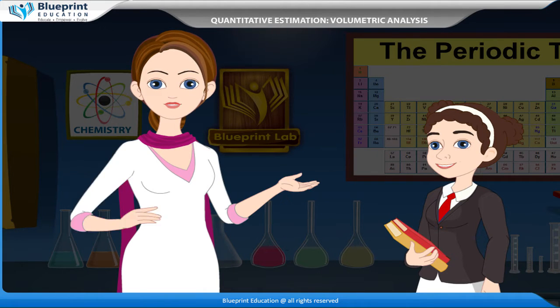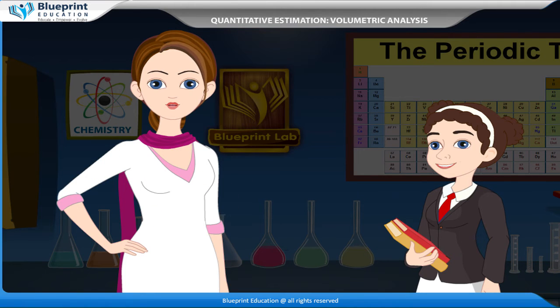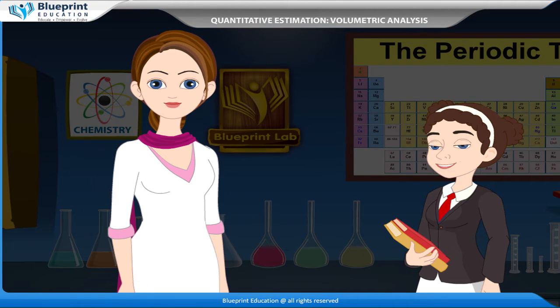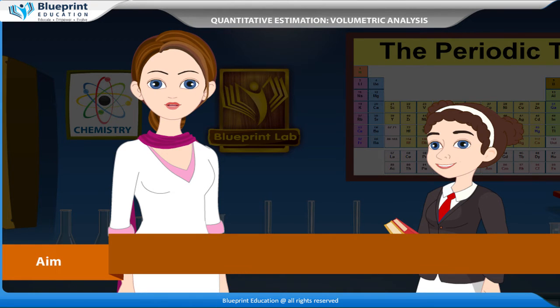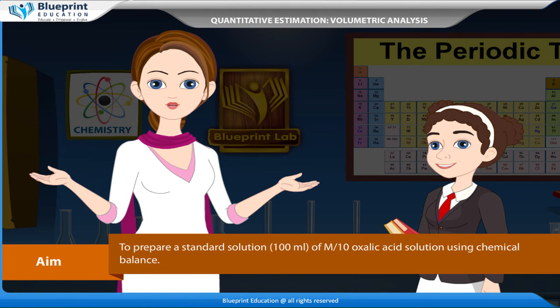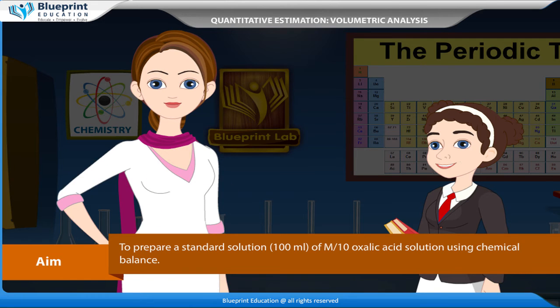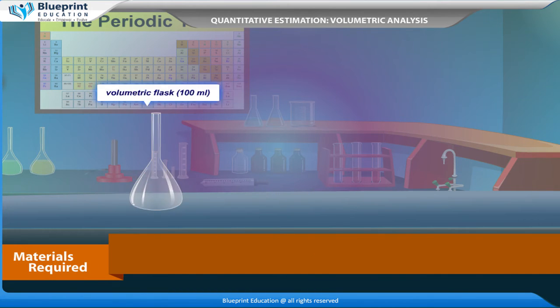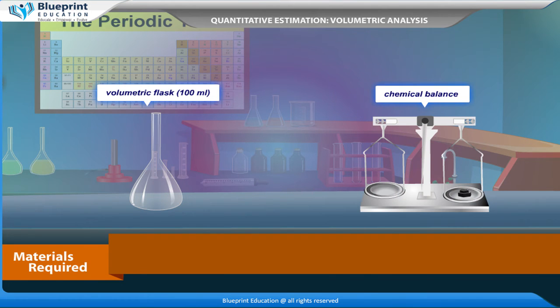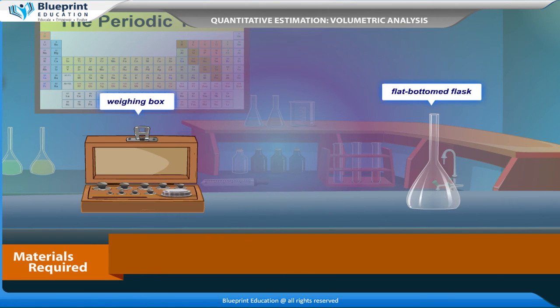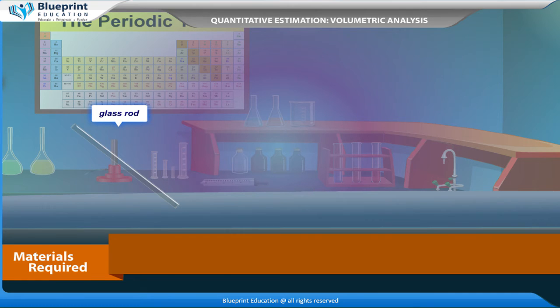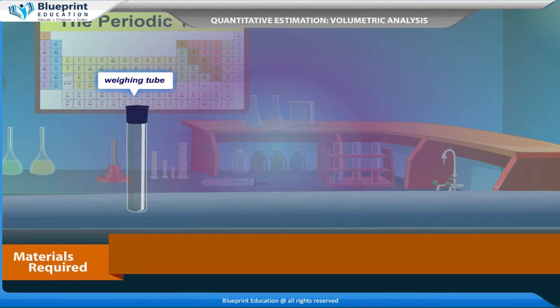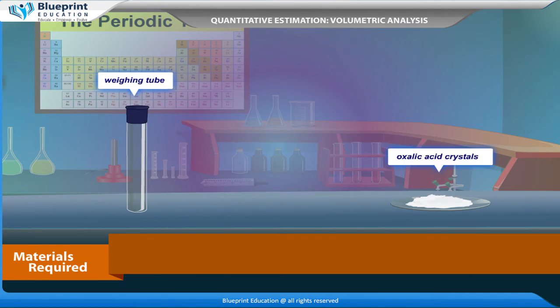Let's do an experiment to prepare a standard solution of 100 ml of M by 10 oxalic acid solution using a chemical balance. The materials required are: volumetric flask (100 ml), chemical balance, weighing box, flat-bottomed flask, glass rod, beaker, weighing tube, and oxalic acid crystals.